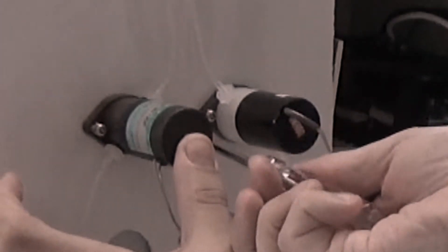Also, valve replacement requires more effort and time due to the reassembly of screws and electrical wiring.